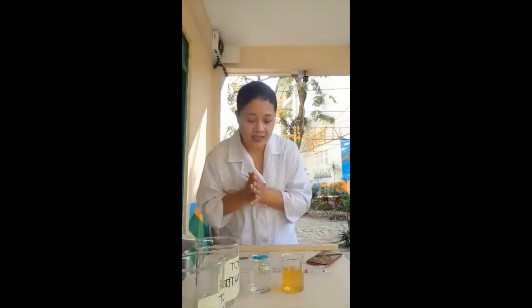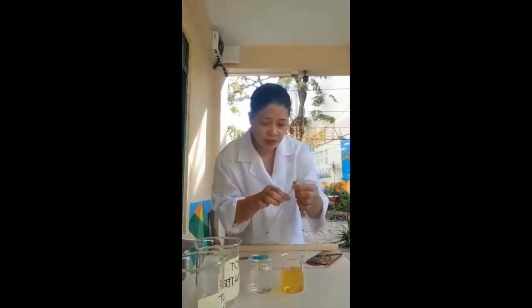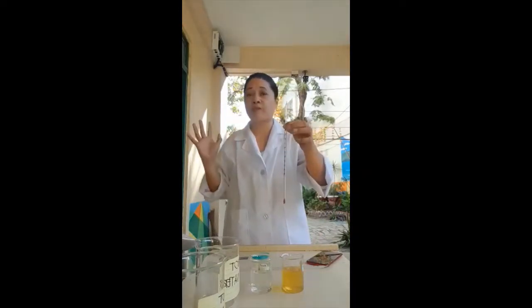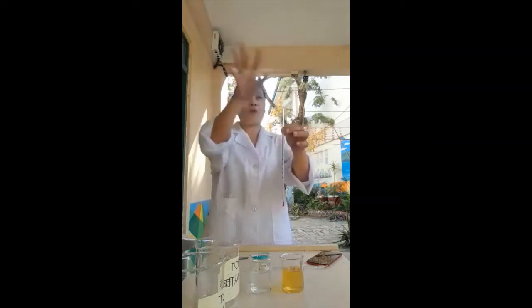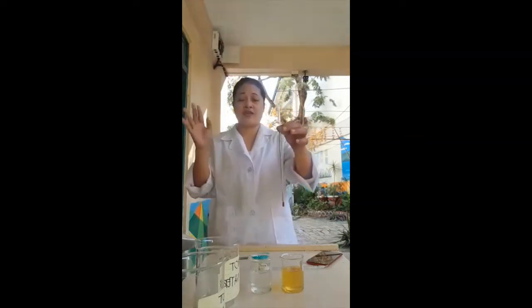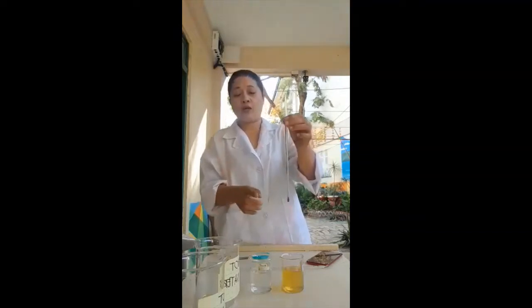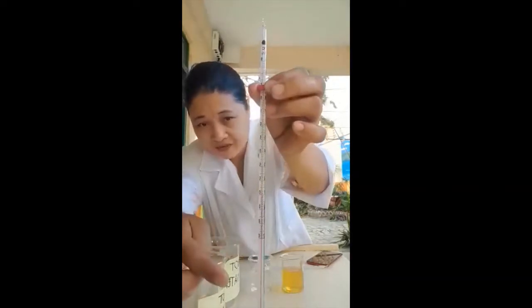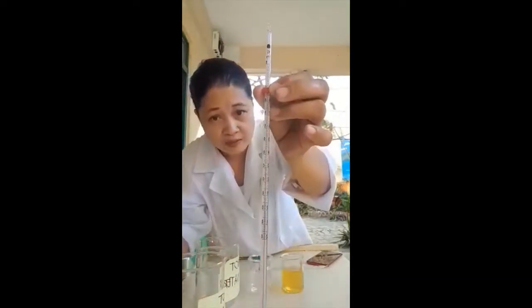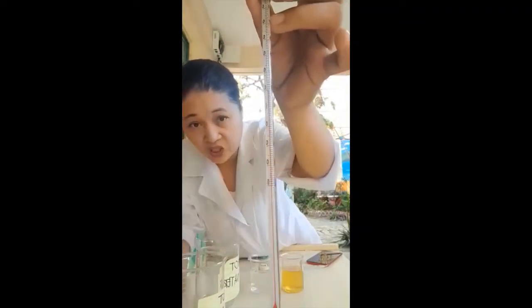So you know already that we're going to get the initial temperature, class. I will get the initial temperature since this is not room temperature anymore because we are outside the room or outside the laboratory. So more or less the weather, the temperature outside can actually affect. But how would you know that that is the initial temperature of the liquid? If the red mark here will not go up anymore or will stay steady for at least 5 seconds, or it will not move anymore, the red mark, can you see? So that's the time that you have your initial temperature.